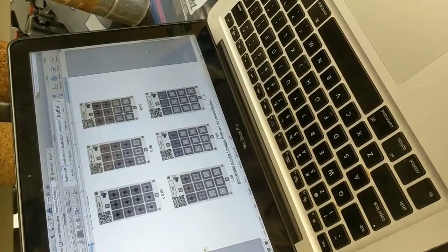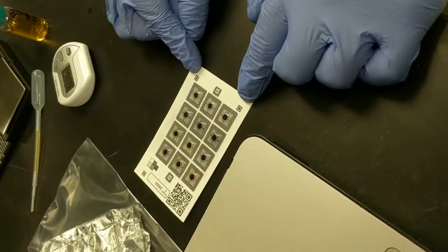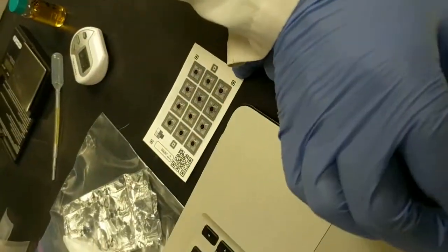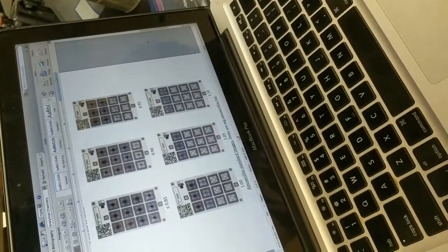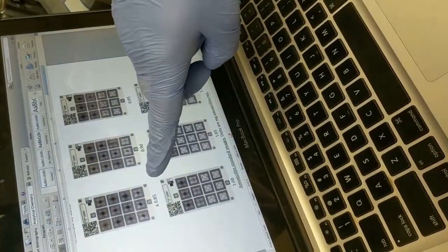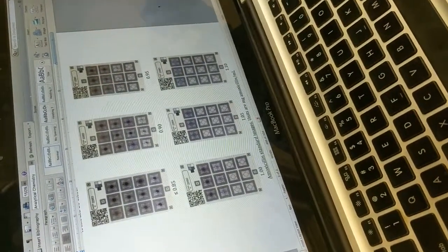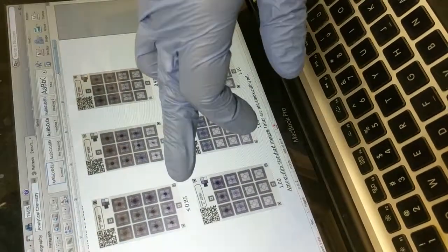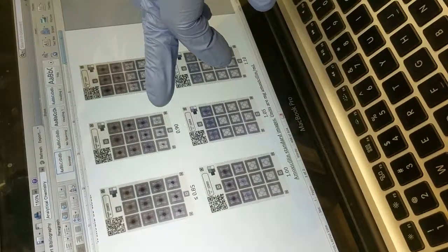It's easiest to start by counting the number of blue circles that have developed. In this test card that I've run, you can see that all 12 circles have turned dark blue. So I'm going to look at all of the standard images where all 12 circles have also tripped. So we have 2 choices here, the less than 0.85 or the 0.90. You can see in the bottom row that in this image the circles are dark blue, but in this image the circles are a lighter blue.